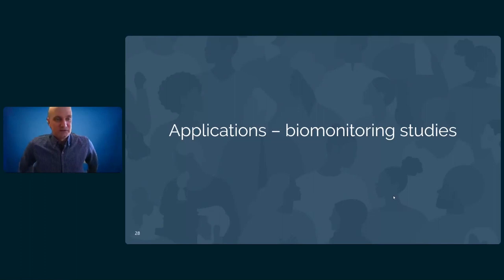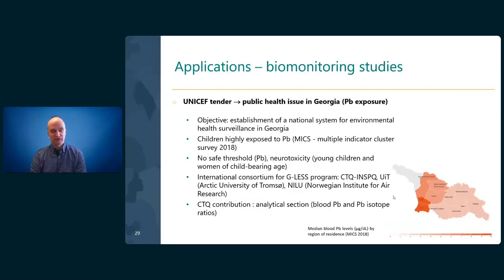Then we applied this new method and this new approach of sampling to real applications in biomonitoring studies. The first one I want to share with you is a UNICEF tender. In January 2022, UNICEF published a tender related to public health issues in Georgia, in Eastern Europe, related to lead exposure.